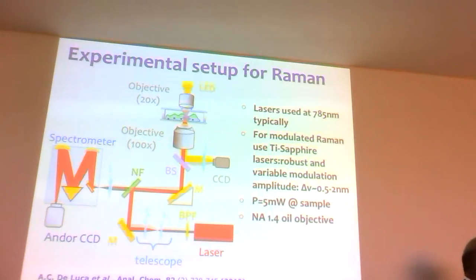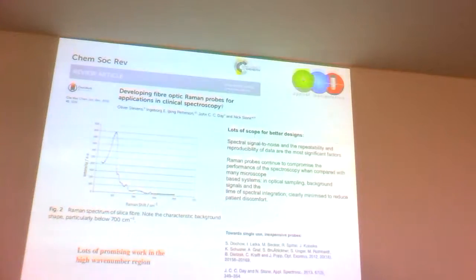So rather unlike sectioning, you might want to worry about, if you like, how much of the sample you really have and interact with. So a lot of people in Raman might not use the highest numerical aperture optics unless they're taking signals from single cells, rather than taking signals from simple biopsy. So a lot of people are working in this area. This is so for students, there's a big area of endoscopic Raman, using this to actually discern tissues.